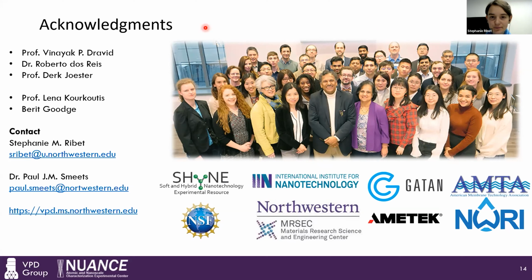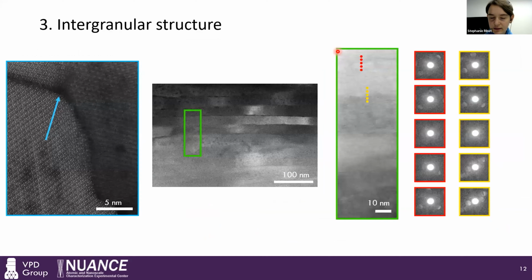It's from Mahmoud. He said in slide 12, do you consider this layered nanocomposites interface as a grain boundary? So if you can go back to slide 12. So I think what you're asking about are these layers. These are going to be basically your grains. So these in between would be the intergranular region. And Paul, you can correct me. This would be like a grain boundary, correct? Correct. Those are grain boundaries. Mm-hmm. Just want to make sure I'm using the right term. But these are the coherent grains that we saw before, just the other orientation.